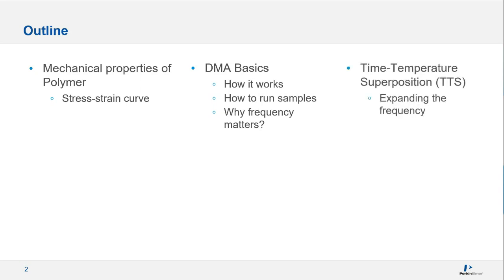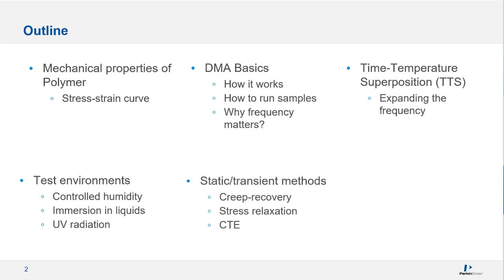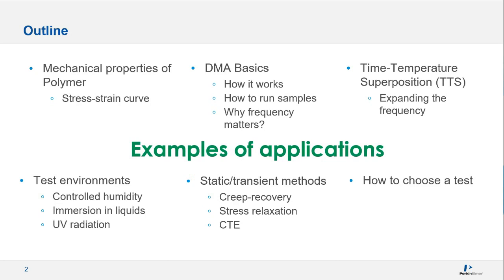and one of the cool capabilities, TTS, time temperature superposition, followed by some test environment that can be added to DMA tests for in-service study. And after that, quickly mention some of the non-dynamic analysis that can be done with the DMA, namely the static or transient methods. And at the end of the talk, I will try to provide some guidance on how to choose the right method for your material. And of course, lots of examples of applications will be demonstrated between these topics.